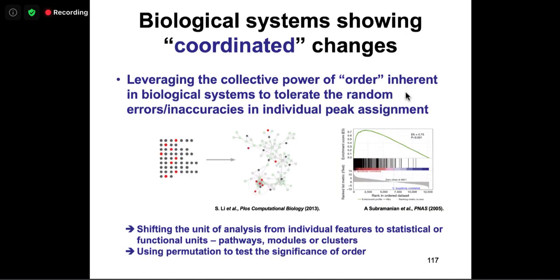So how do we do that? We borrow this thinking from GSEA. We already mentioned enrichment analysis; it looks at the group behavior. An individual can be random, but when you have a consistent group pattern, you are more confident. How do you see the significance? Well, we do permutation. GSEA is a permutation approach, which takes some time, but nowadays it is much, much faster now that we understand how it behaves. We also do this for mummichog, also very fast.